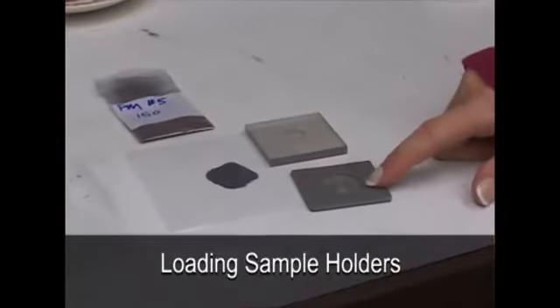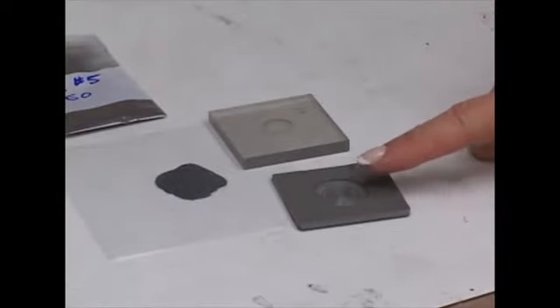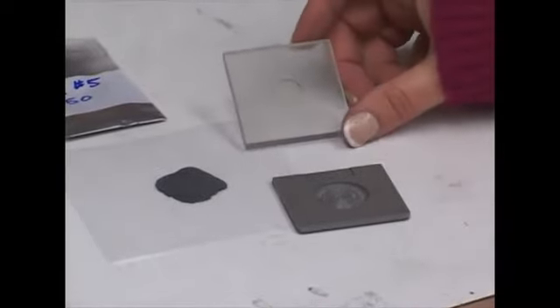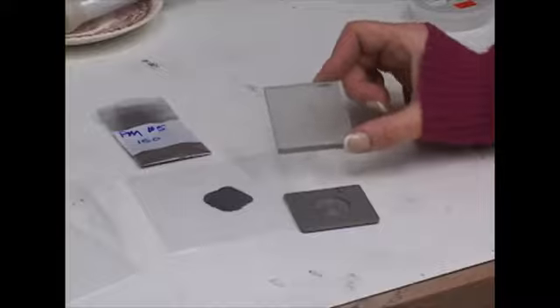There are two sizes of sample holders here. This large well is preferred because, as I said, the more particles that you have represented on this surface in all of the various crystal planes, the better your data is going to be. But often most people don't have this much material, and this will work if your material has been prepared correctly. It's just really important to make sure you have a very fine powder.